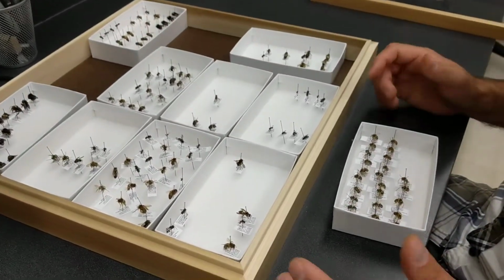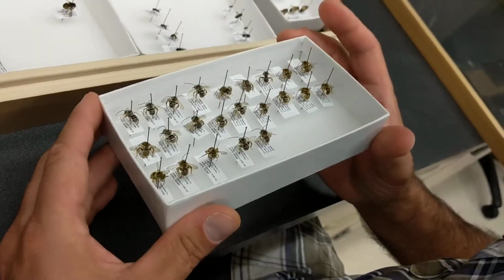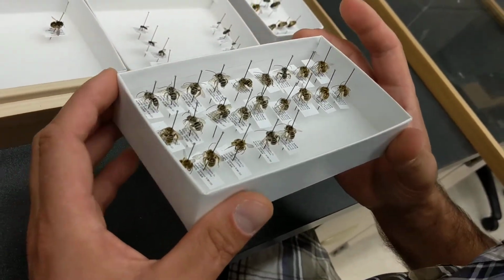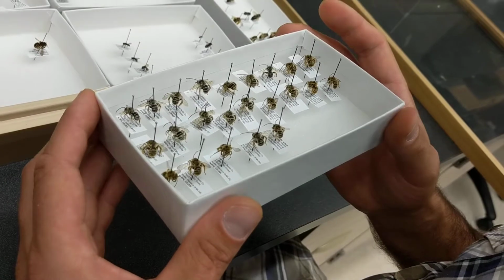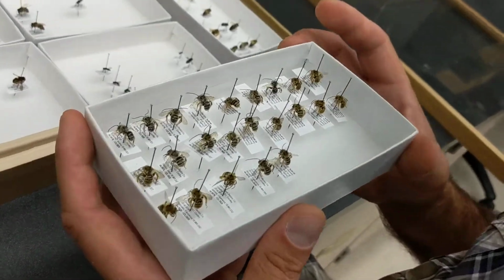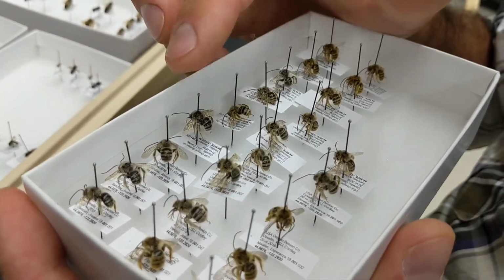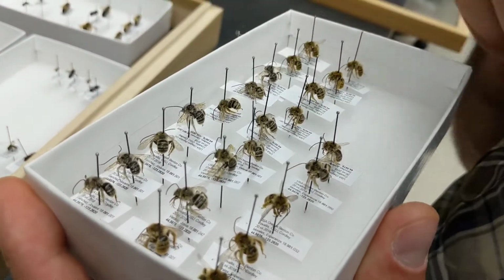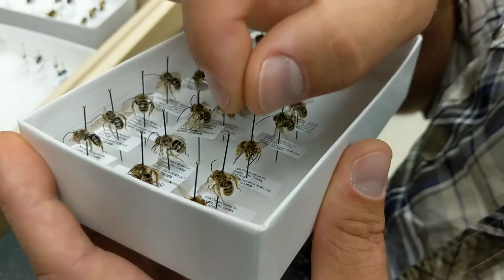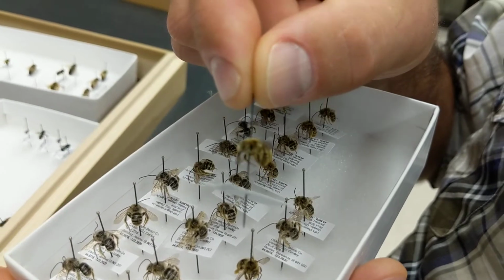I'm not going to do them all because there's another 40, but if we just look at this box, we can see that maybe there's two different species here. So we can take a closer look, and we see that some have really pale pubescence, so really kind of white hairs, and the other ones are quite tawny or brown or tan colored.